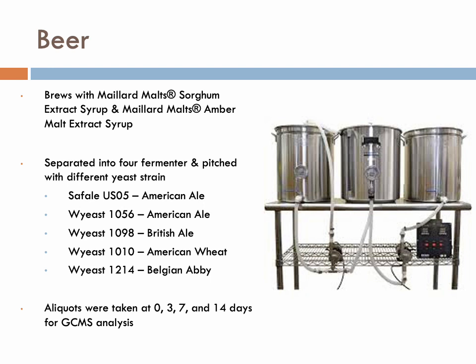So this is my fancy brew system. It doesn't look that nice. It's currently stuck in a hood. It's a 3-pot system, and for the first work we had for sorghum, we were taking a shortcut using what's called malt extract. So somebody else did the steeping of the grain, took out all of those simple sugars, and then condensed it, concentrated it so it became like a syrup, and that's what we used, right? So we used either that sorghum syrup or this amber, which is a barley-based syrup.